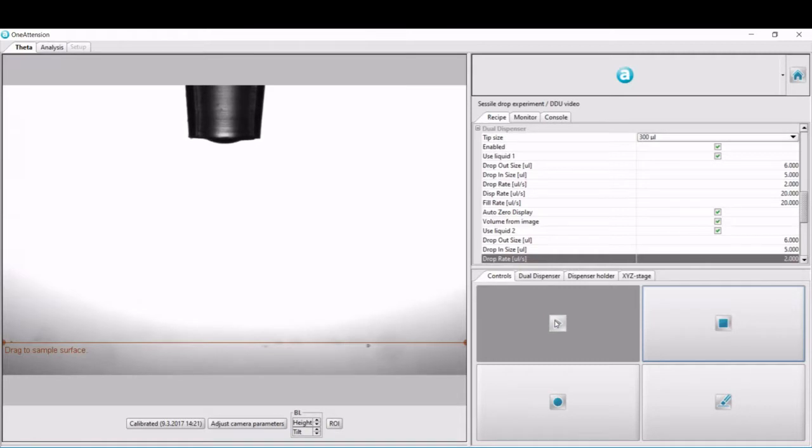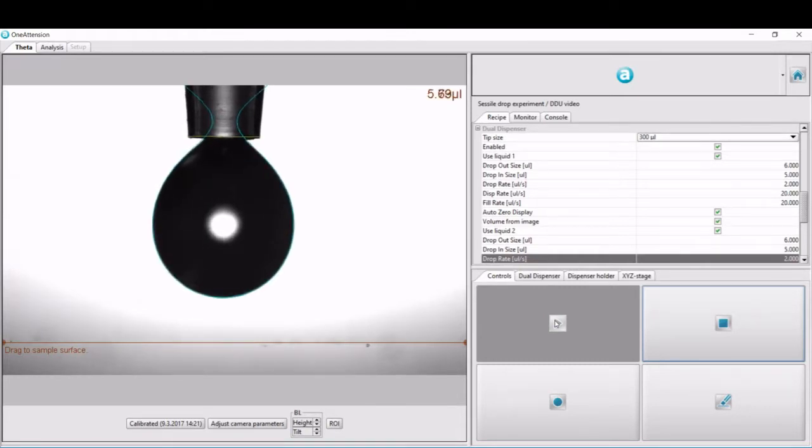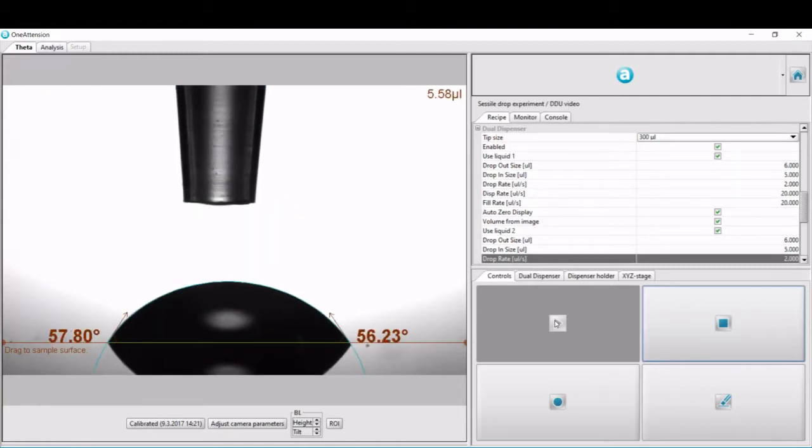In OneAttension software, when you start the measurement, the software automatically creates a droplet of desired size, places that on the sample surface, and analyzes the contact angle of the droplet.